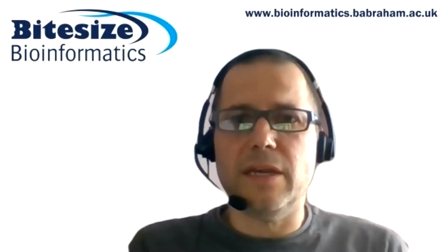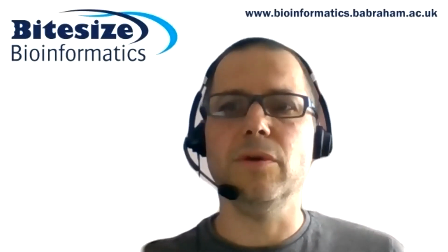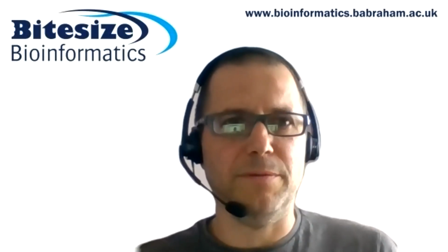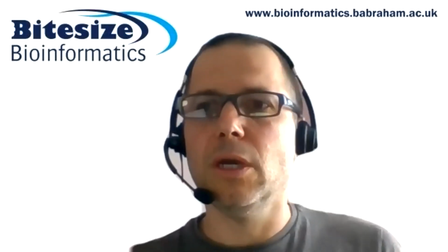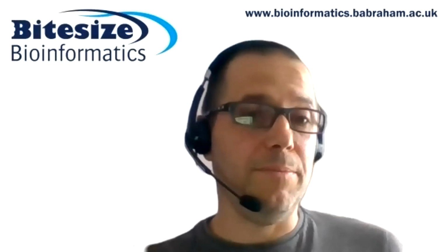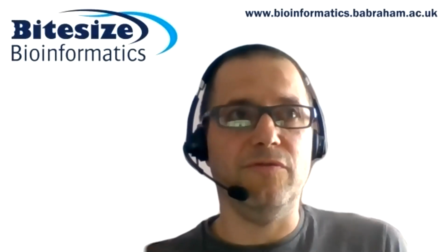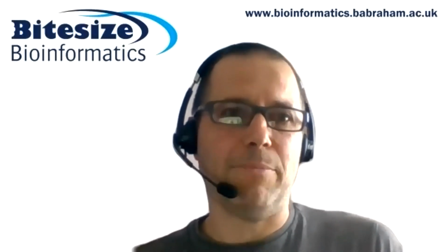Okay, so today in the Bitesize Bioinformatics session, we are going to take a look at SeqMonk, which is a piece of software we've been developing at Babraham for about 11 years now. It's quite old. This is a piece of software which exists to visualize, explore, and analyze large sets of mapped sequence data.